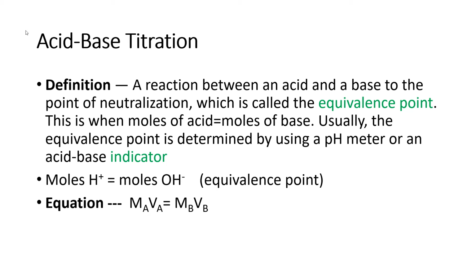What a titration is, and there's a video of me doing a titration. It's basically you're trying to determine what the concentration of either the acid or the base is. And the way you do that is you must know the concentration of one of them, and also know how much you use of each one. So if I use a certain amount of acid and I know its concentration, and I know how much unknown base I use, I can figure out the molarity or concentration of that base. And that's what a titration does.